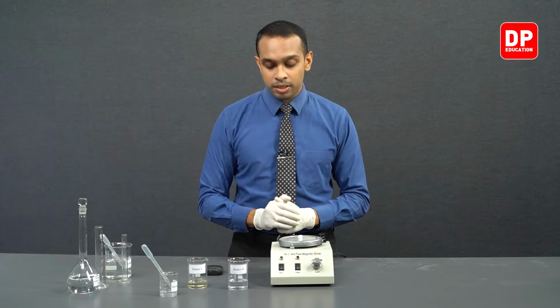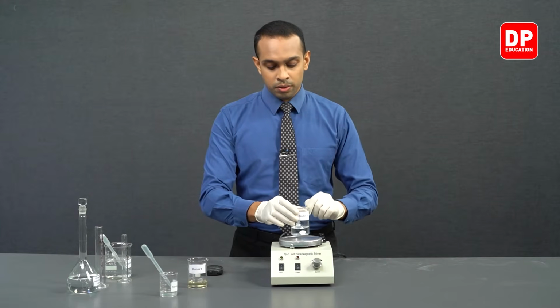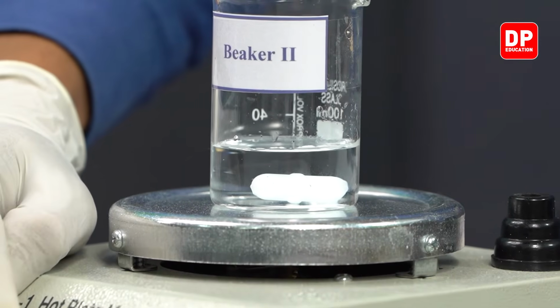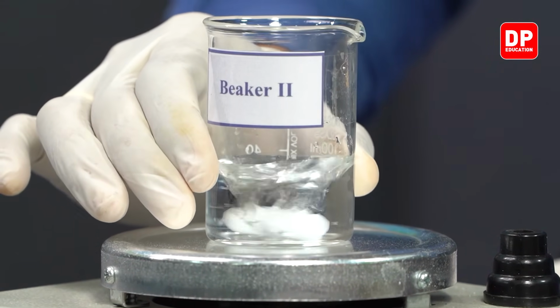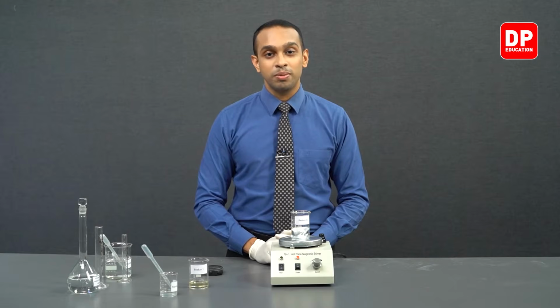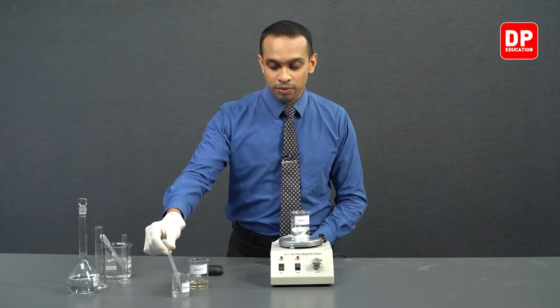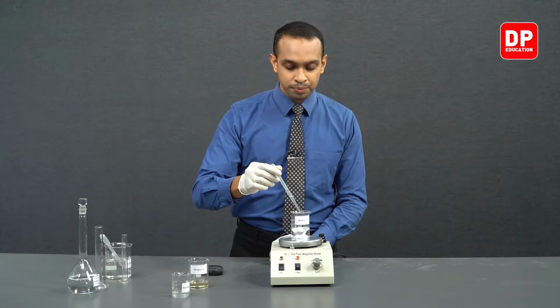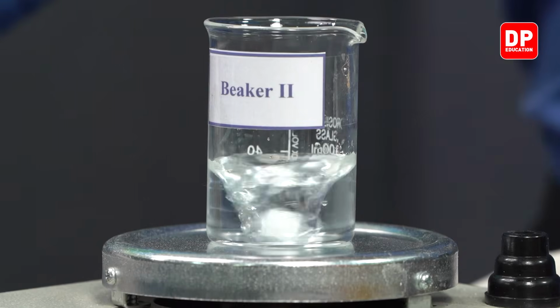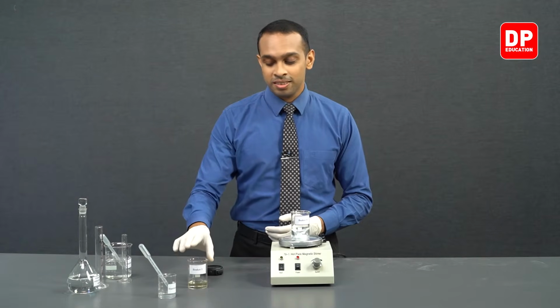So like we did in the previous experiment, we are going to place this beaker 2 on our magnetic stirrer, and then we can turn this on, and we will be adding contents of beaker 1 into the contents of beaker 2 here. Before we do that, don't forget to add the starch solution as well. We need to add 5 drops of the starch solution. And then we'll be moving on to adding our contents of beaker 1.